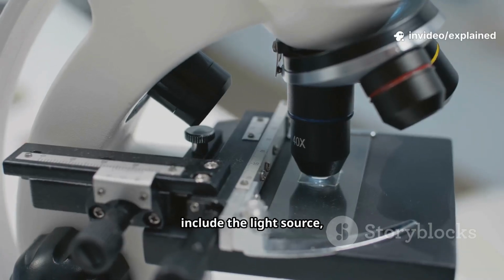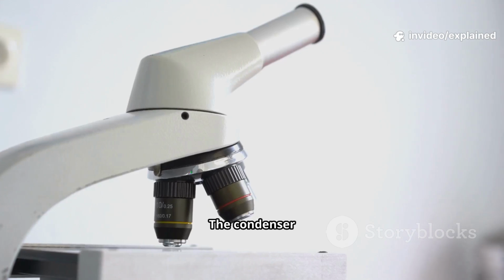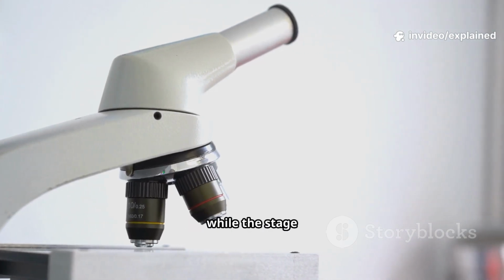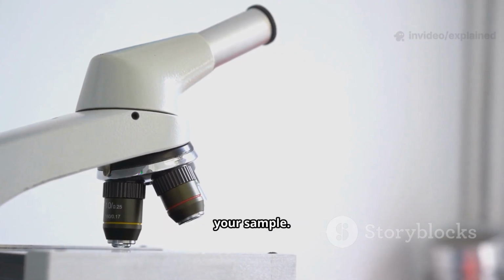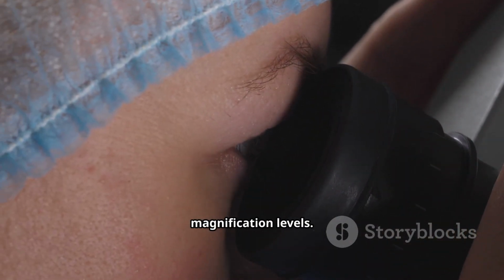Key components include the light source, condenser, stage, objective lenses, and eyepiece. The condenser focuses light onto your specimen, while the stage holds and positions your sample. Multiple objective lenses on a rotating nosepiece let you quickly change magnification levels.